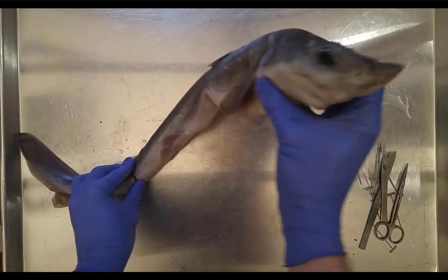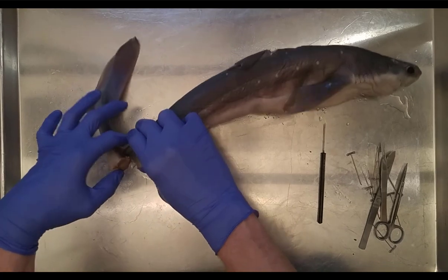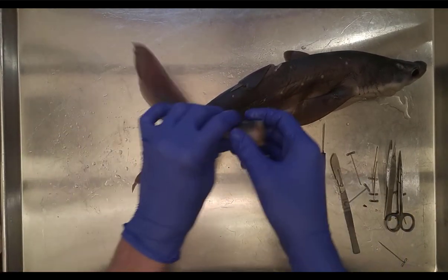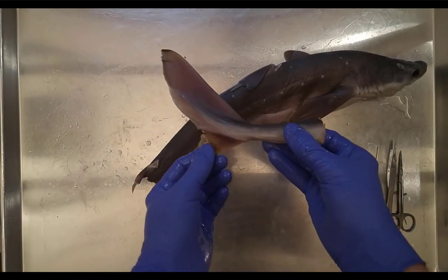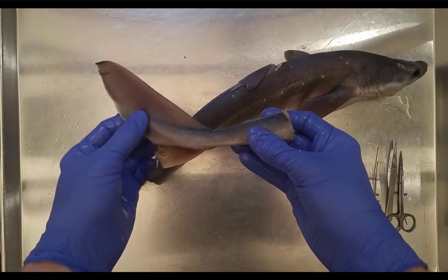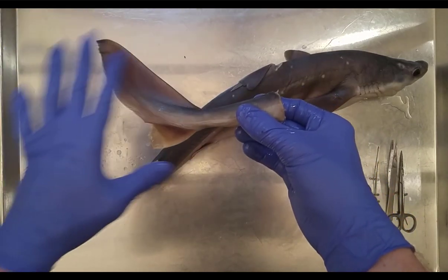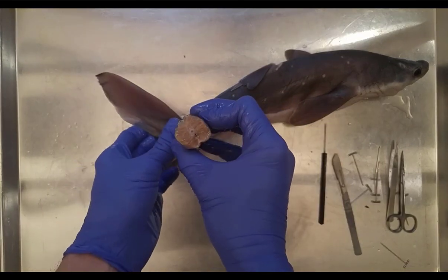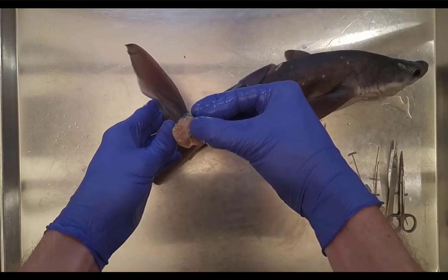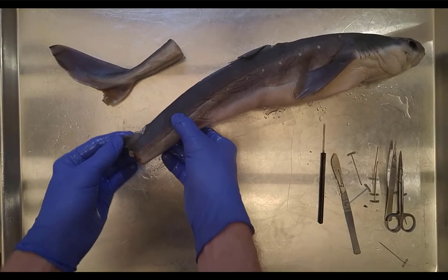Let's talk about external morphology. Looking at the tail — it's been cut so they could inject it with preservative formula, so don't worry about that. What you notice about this tail is that it is heterocercal. This is the caudal fin: the dorsal lobe is much larger than the ventral lobe, and the tail actually extends into the dorsal lobe. Inside you can see the blood vessel and the cartilaginous backbone, similar to the notochord of early vertebrates.